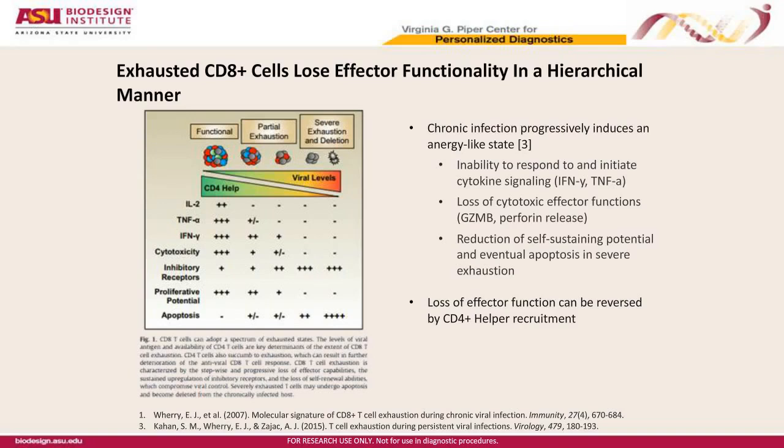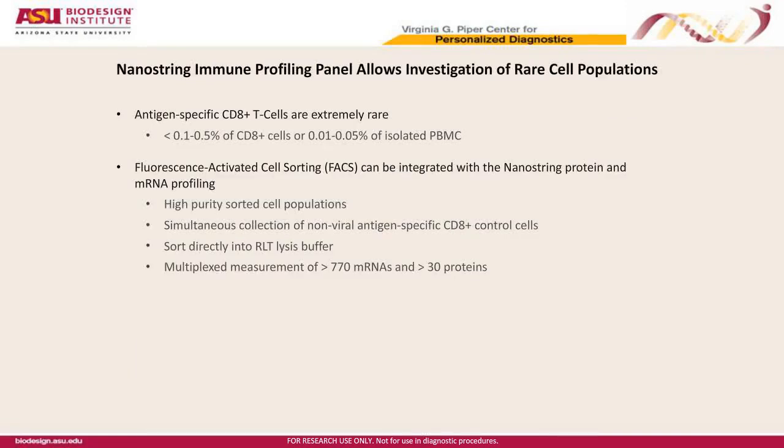And so we were interested in particular in looking at a number of these different biomarkers and doing more deep profiling of antigen-specific T cells, but to be able to do it in a more rapid way rather than isolating for RNA-seq analysis or other types of approaches. So we were interested in sorting antigen-specific T cells and looking both at protein profiling and RNA profiling.